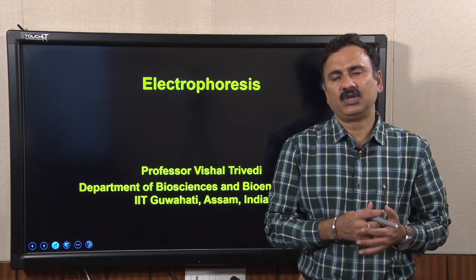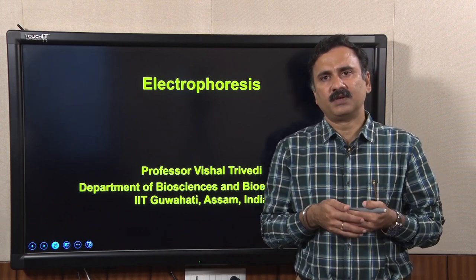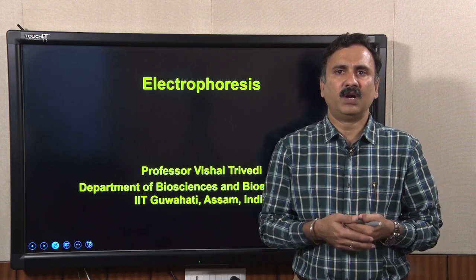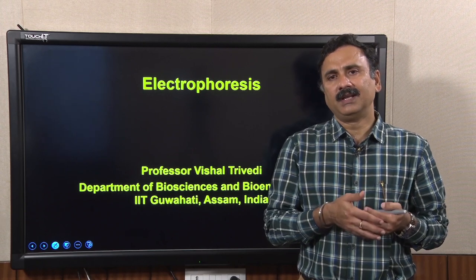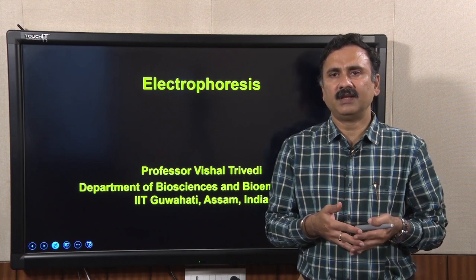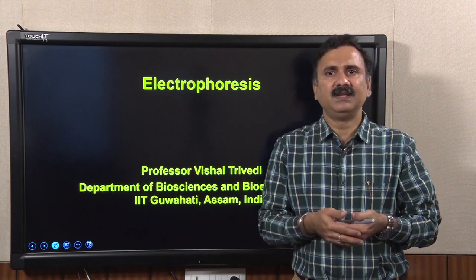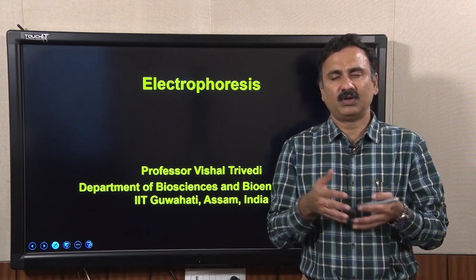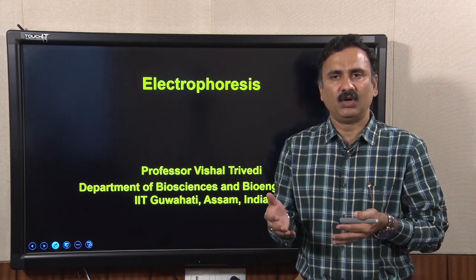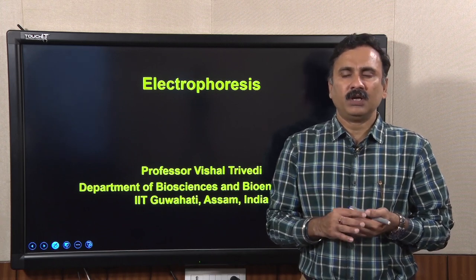In the previous lecture we discussed the basics of electrophoresis and how it separates different types of molecules, and how the technique evolved. Initially people were using moving boundary electrophoresis, and then they overcame the deficiencies in that technique by introducing solid support media, for example acrylamide or agarose, and as a result they developed zone electrophoresis.